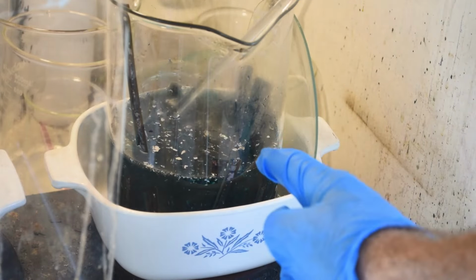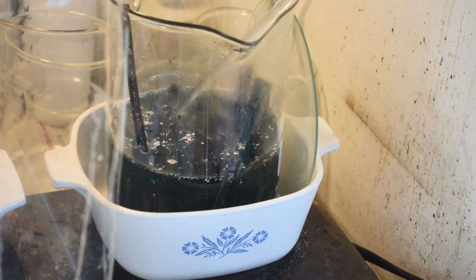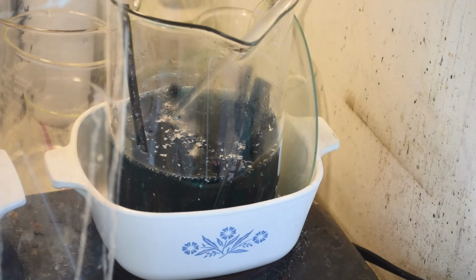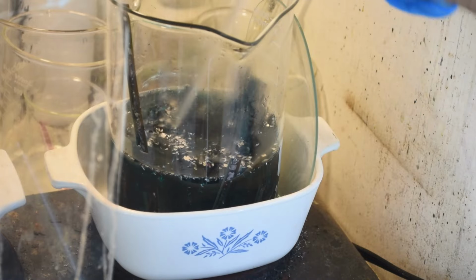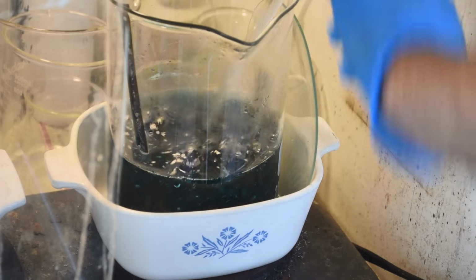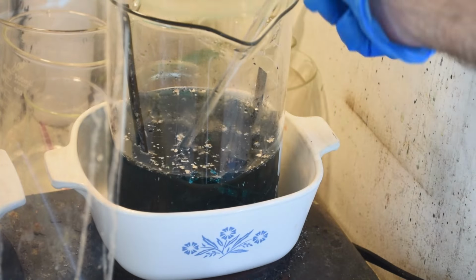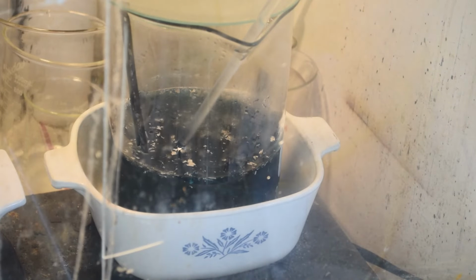But yeah, if that's palladium, which I'm not 100% convinced it is, but if that's palladium floating in there, it probably won't start going into solution until after all the copper is in solution. It would just cement out again on copper and wind up floating as a foil again. So, what can we do? I don't know. I have to think about this. At this point, I'm open to suggestions from my audience.